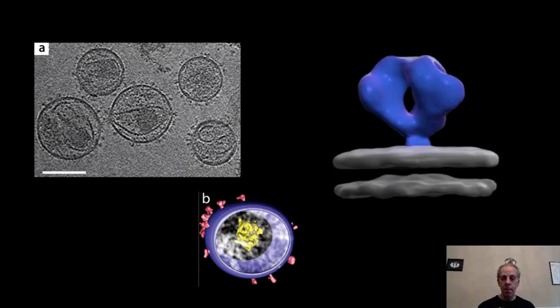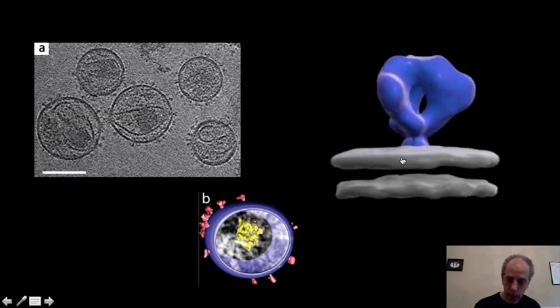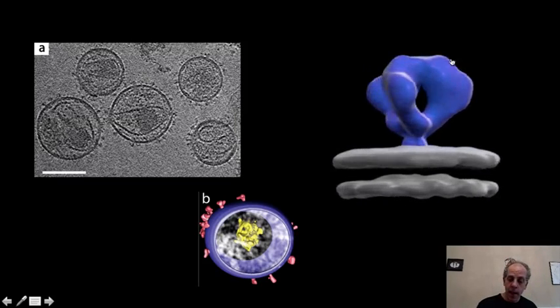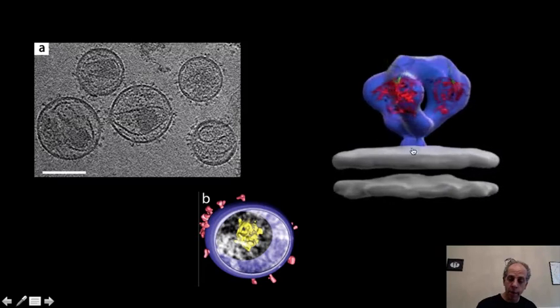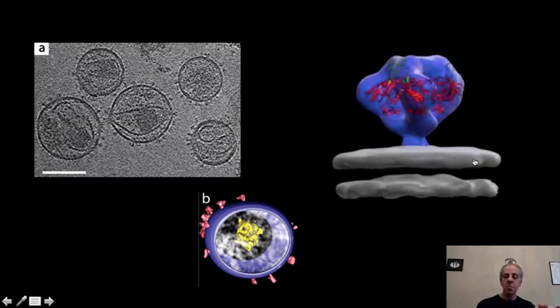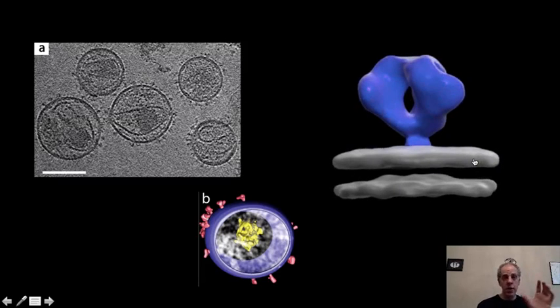You have the membrane that you were expecting, and I'm going to just run this video. And this is the shape. This is the envelope that you were looking for. And then you try to fit pieces that for other reasons are known, and you see, oh, this is one of my validations.